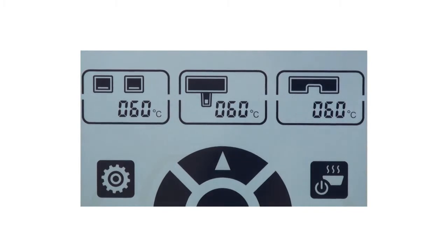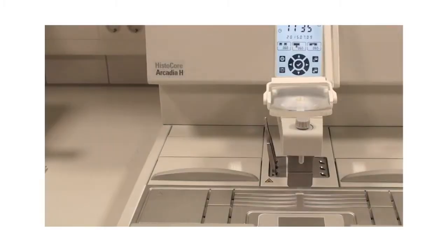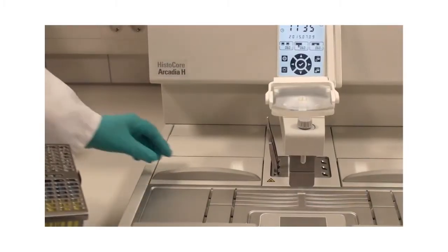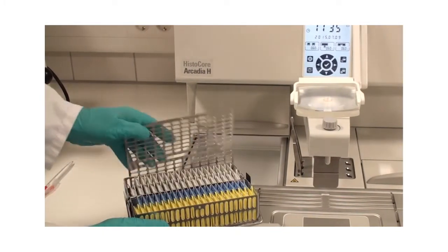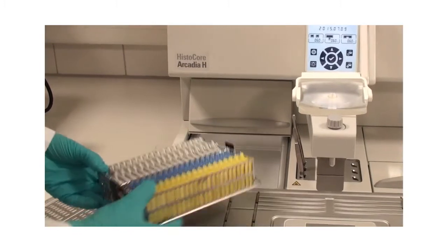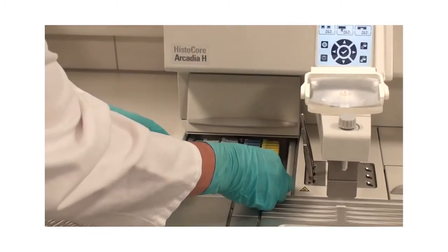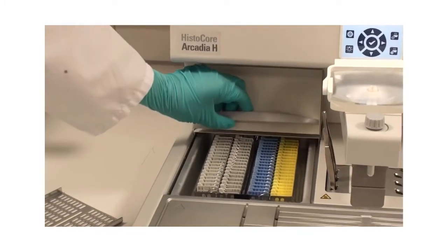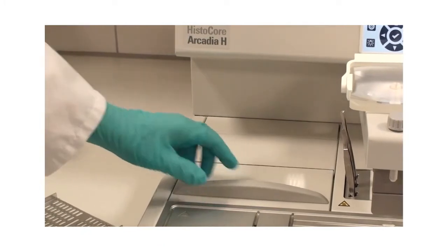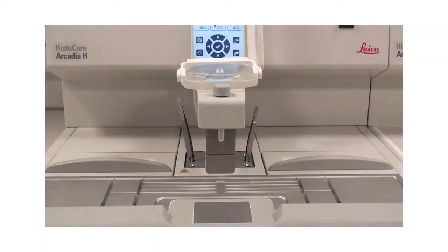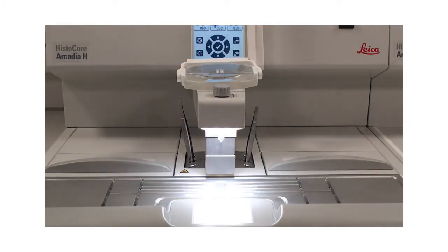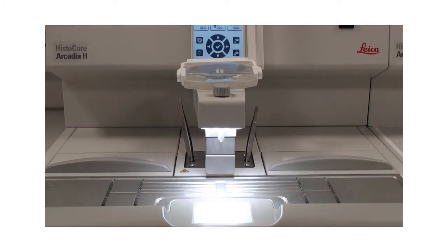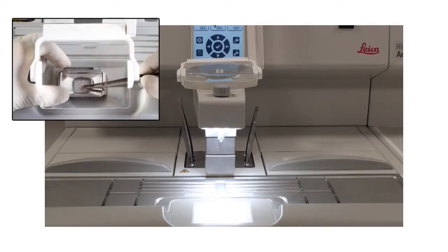When your Arcadia H is heated, you may store your cassette baskets in the cassette bath and start the embedding process. An LED light provides bright, even illumination of the embedding area and the cold spot for optimum visibility during paraffin dispensing and orientation of the tissue specimen.